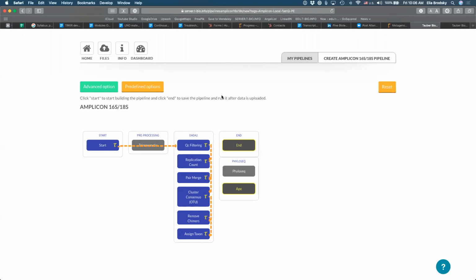And now we can look at where they fall in the taxonomy, which is what we want to calculate diversity, because taxonomy ultimately shows us not just that this belongs to this species or group, but that it has a certain relationship. That relationship is measured in evolutionary distance, and that's where we come to phylogeny.